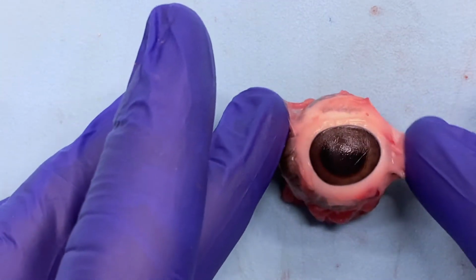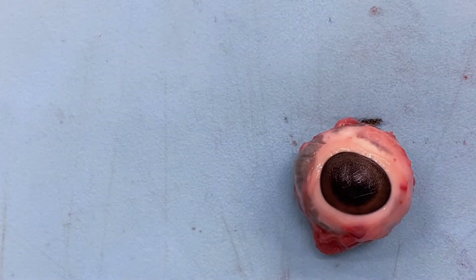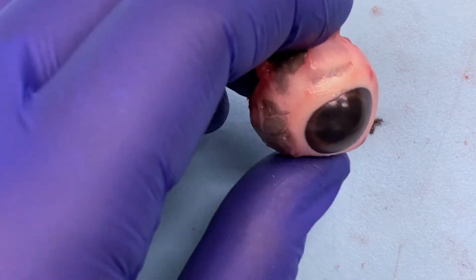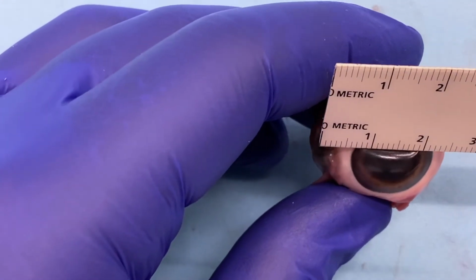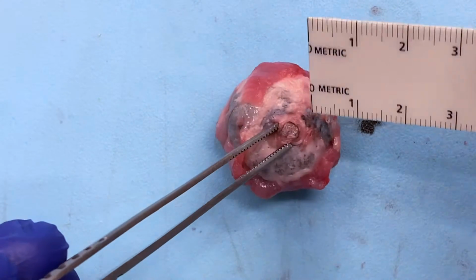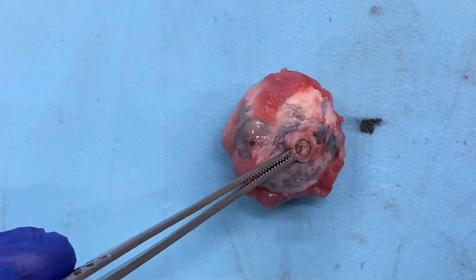Like I said, orientation isn't critical, so we can rotate this eye 360 degrees and make our section as ideal as we want in order to make sure we get all the important components into one slice. So we'll do a transillumination to get an idea where the tumor is, and then we're going to go ahead and measure this. For the eye component, we'll measure in 3D, so we'll say 2.7 by 2.5 by 2.3 centimeters. And then we'll measure the component of the optic nerve. That's going to be, looks like, 0.2 centimeters in length and 0.2 centimeters in diameter, so not a whole lot left.